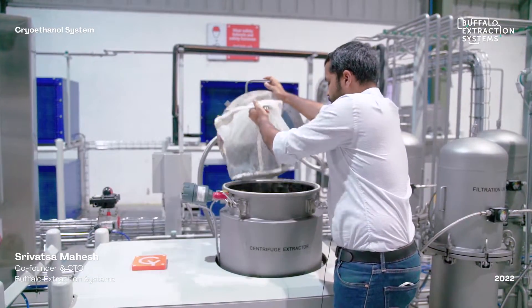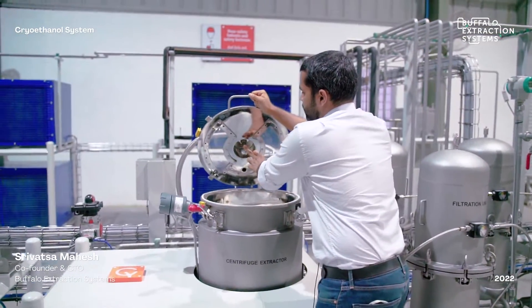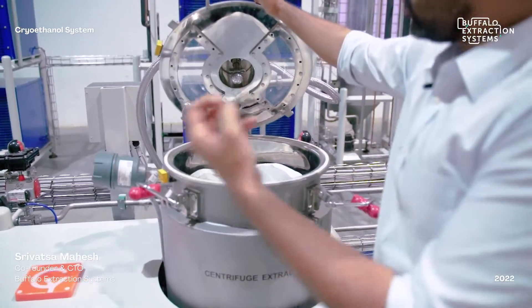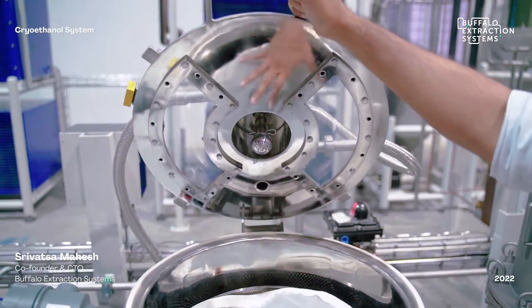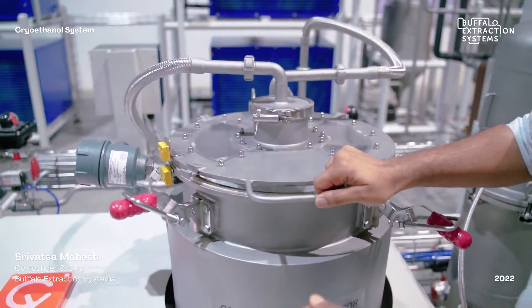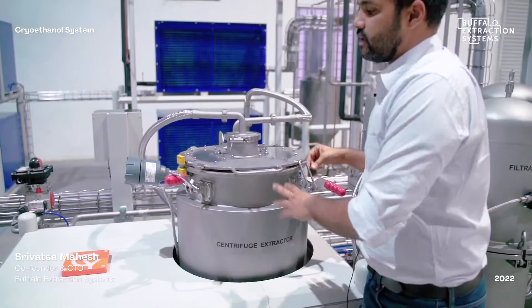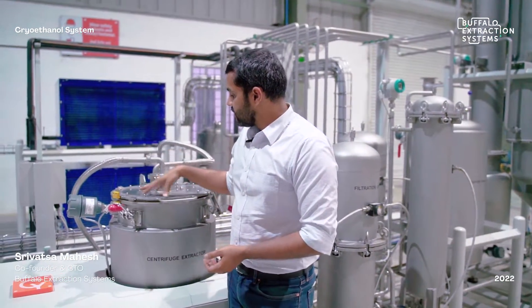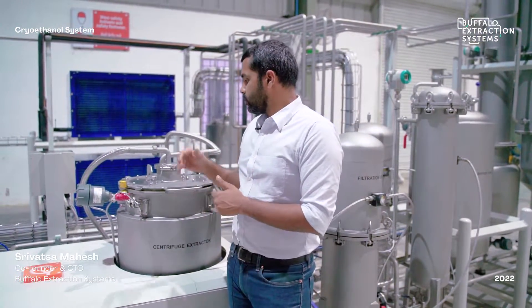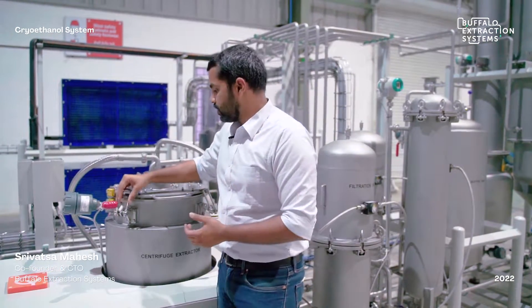The biomass is loaded into the basket, the centrifuge is closed, and a spray ball injects the cryogenic ethanol into the vessel. Limit switches, safety switches, and level sensors ensure there is neither overfilling of ethanol nor operation when the lid is not properly closed, ensuring safe operation throughout the process.